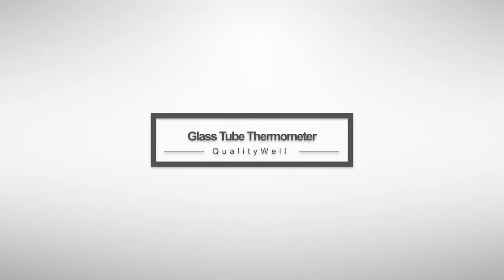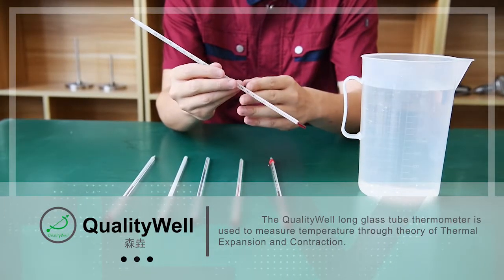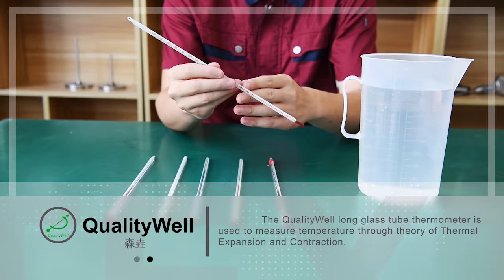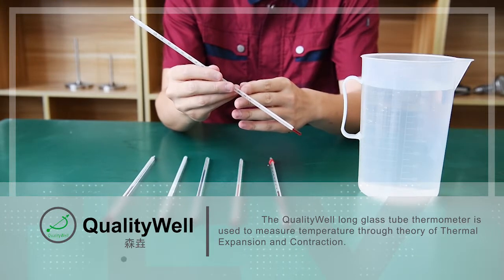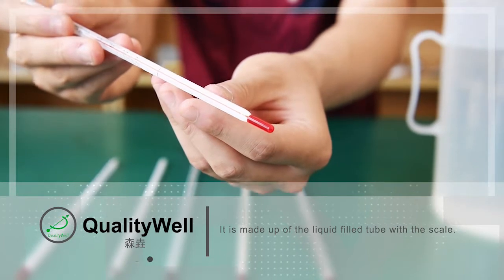Glass tube thermometer. The QualityWell long glass tube thermometer is used to measure temperature through thermal expansion and contraction. It is made up of a liquid filled tube with a scale.